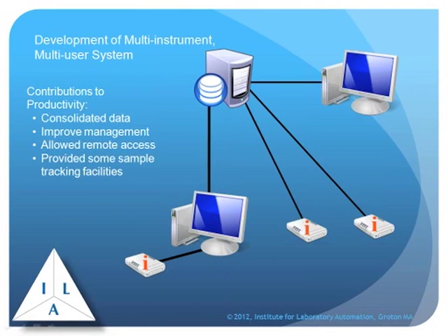This is another example of instrument data systems where you have multiple instruments being supported by multiple users, all in the same part of the same network package. All the applications work here. The database works here. The data from the instruments comes into it either over communications lines or through a separate computer system. This occurs very frequently in chromatography. Justice Chromatography is one example of it. Varian had the same type of products, as well as other vendors.